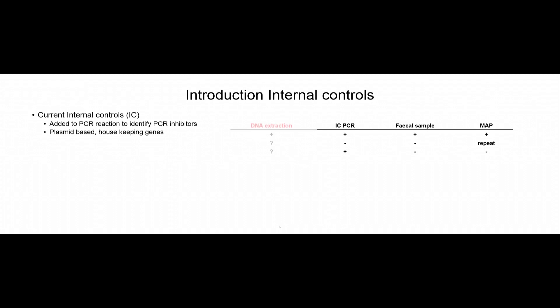If your internal control is positive and your fecal sample is negative, then most often MAP is negative as well. But what happens depending on the DNA extraction method you use? In one case you don't know if the PCR is inhibited or your DNA extraction is poorly executed. And if the fecal sample is negative but the PCR internal control is positive, it tells you the inhibitors are fine for that PCR reaction, but it doesn't tell you if your DNA extraction worked or that MAP cells are being lysed efficiently.